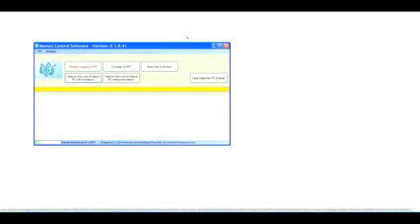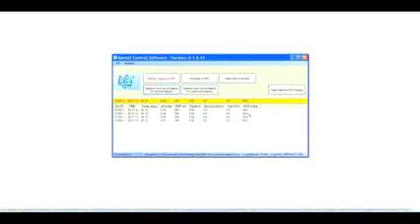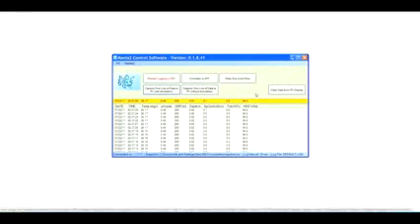And if the USB is already loaded, the control software will initialize and you will be scrolling data. And we are now scrolling data. As you can see, we're on a one second interval. The data is scrolling down. In the orange bar at the top, the most current data is displayed.